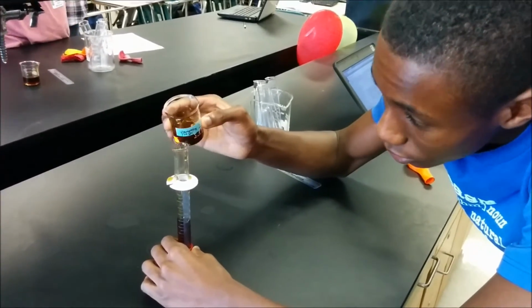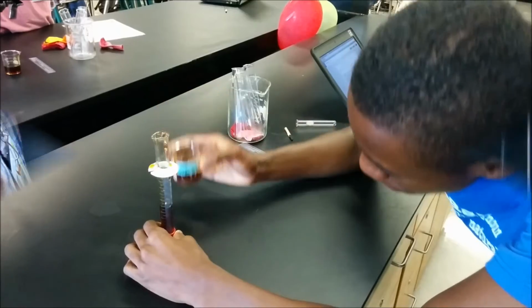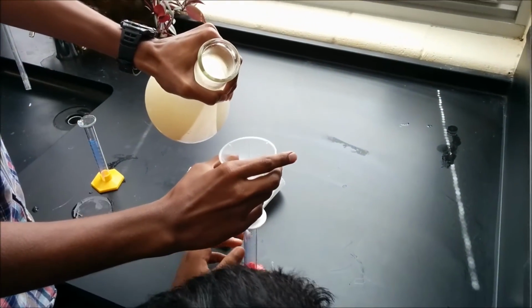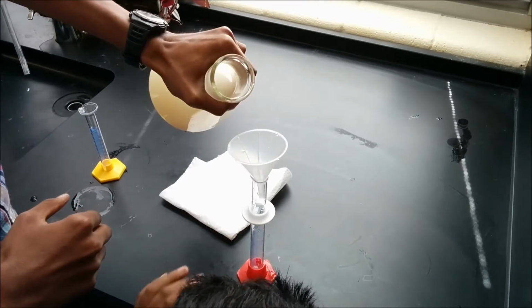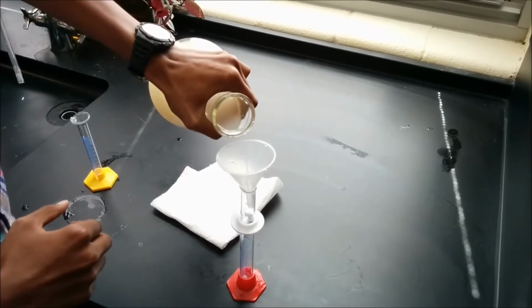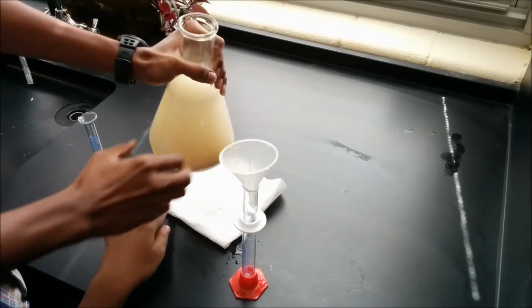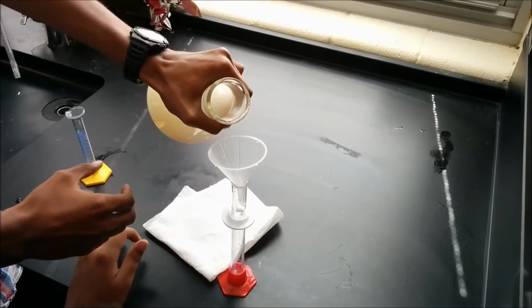So exactly how much do you have to pour in? 5 milliliters of yeast. And what's that? It's a yeast solution. And so how much of this do you need? 5 milliliters. What are you going to do with it?